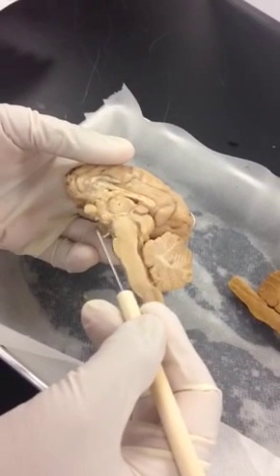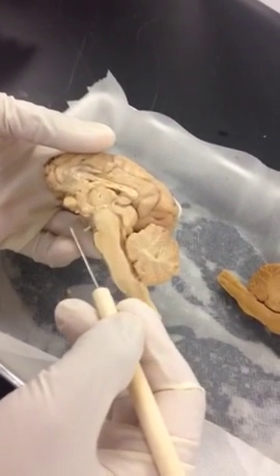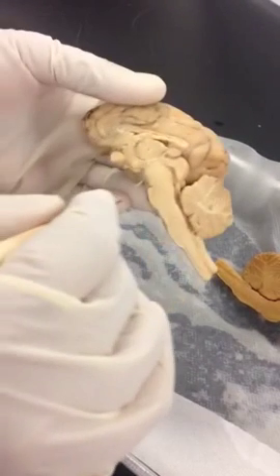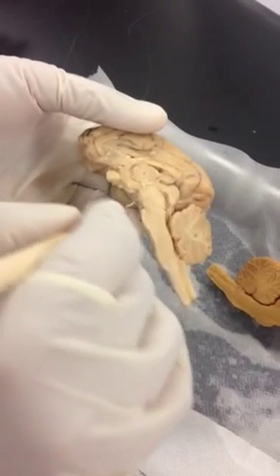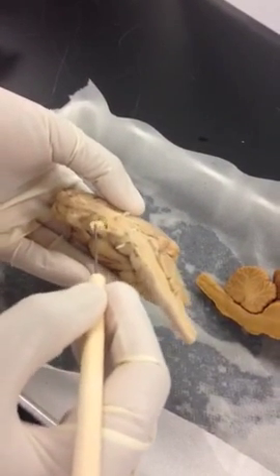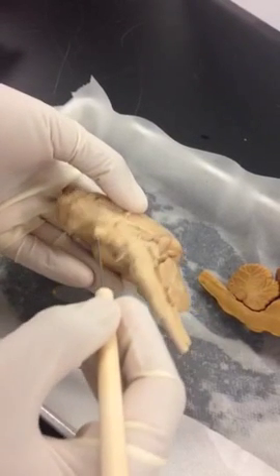So the infundibulum is used to hang the pituitary gland from here. So your pituitary gland, it's not here in this specimen. If it were there, it will be here. Okay. So what you see here is your optic nerve actually.